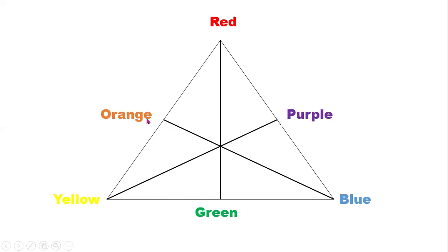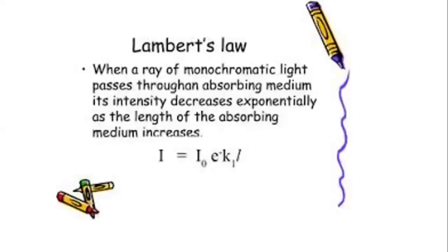So you've already carried out this practical. You have seen the different wavelengths that you obtained from the spectra, and you have observed the corresponding light that is absorbed by the solution in the region that is opposite to it. And I believe you understood that because you have carried out the practical.